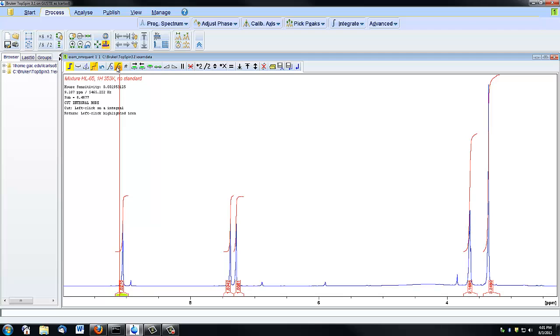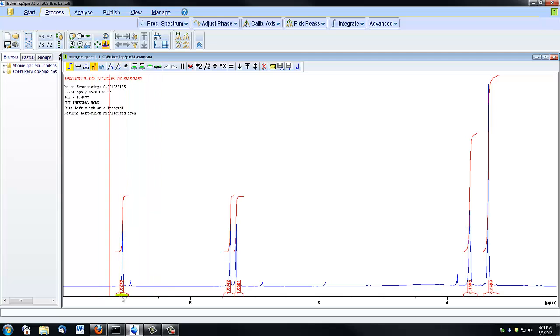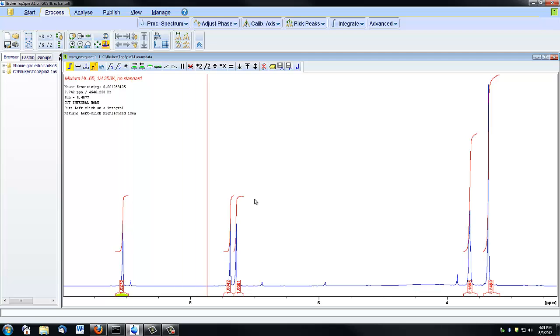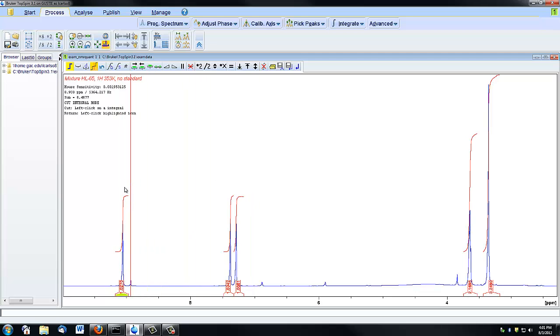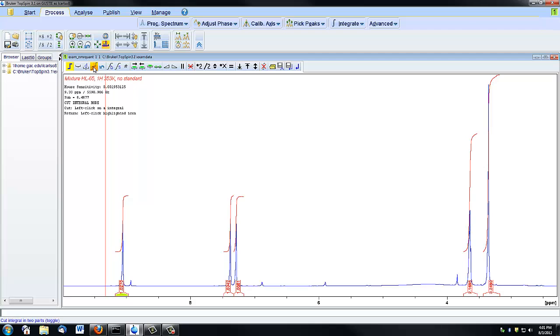So you can just kind of mess around with those until you've got a nice integral shape. And you'll notice that the value actually changed when that happened, which is important because you're getting more accurate results if you actually do this.